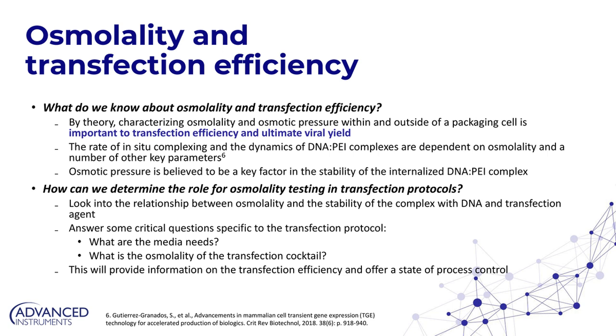Ultimately, we want to look into the relationship between osmolality and the stability of the complex of the transfection agent, whether it's PEI or whatever, with the DNA. The goal of this would be to answer some critical questions specific to that protocol. So when we look at the solutions that are involved, that's where we would measure the osmolality.